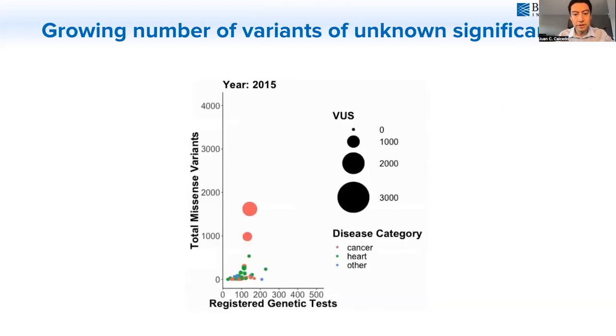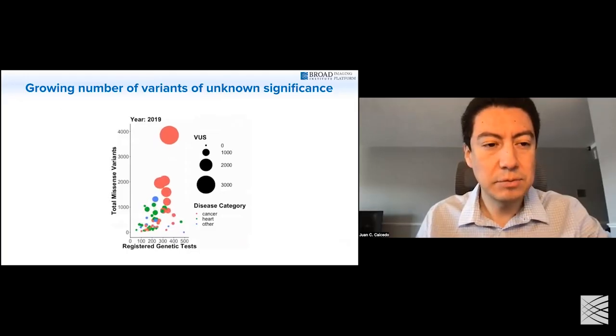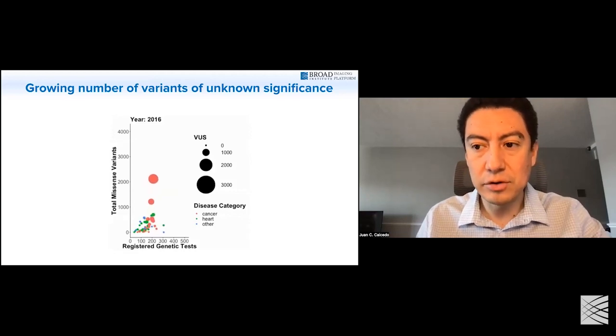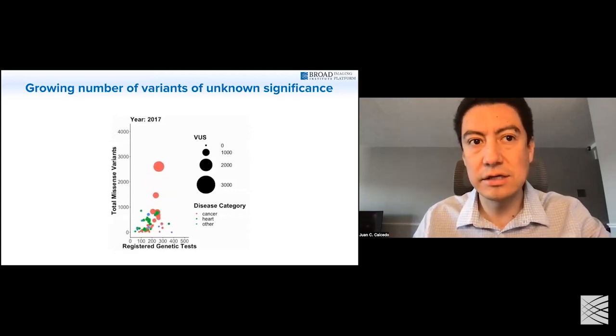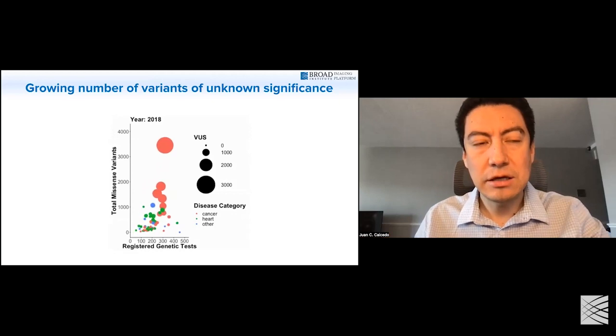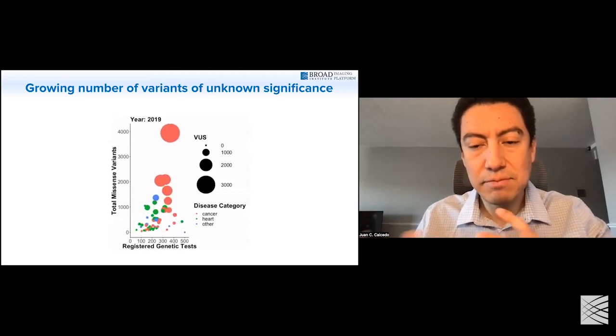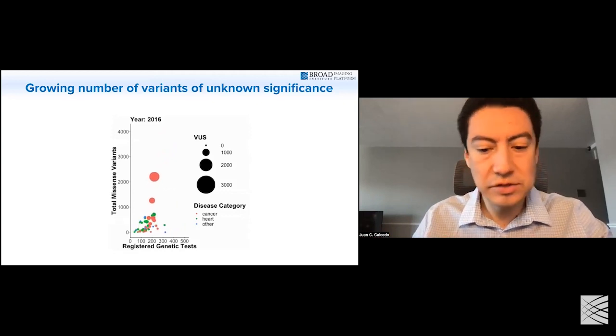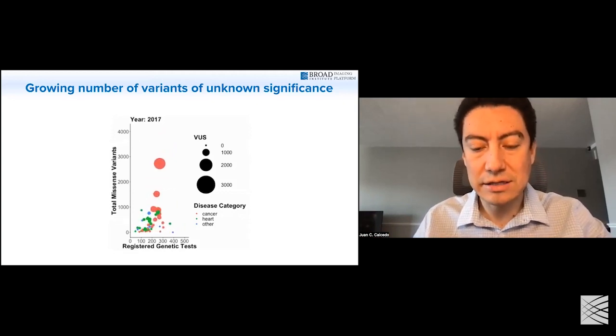So the motivation for this project is that we want to understand and be able to characterize whether variants that are reported across many different diseases can be identified as impactful or non-impactful using some sort of systematic assay.